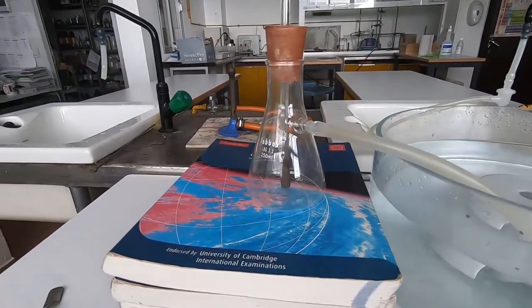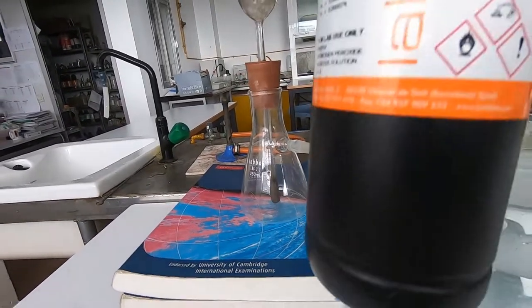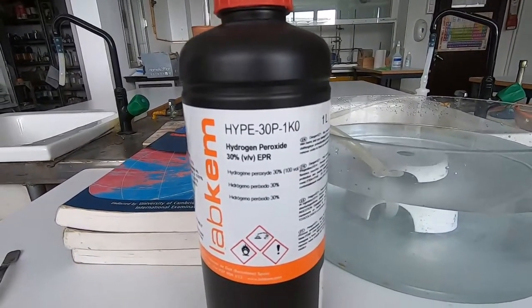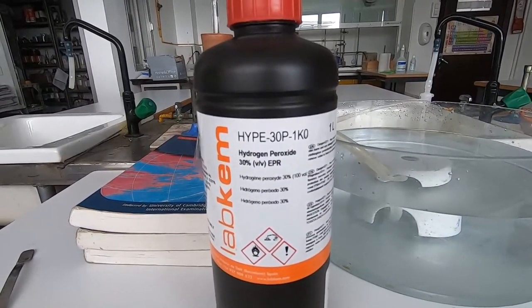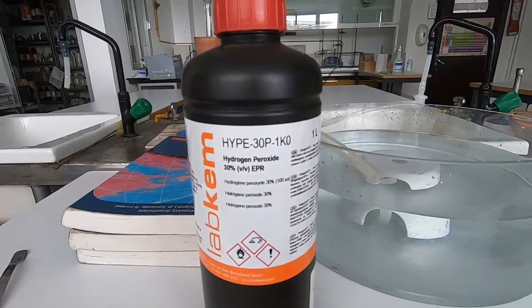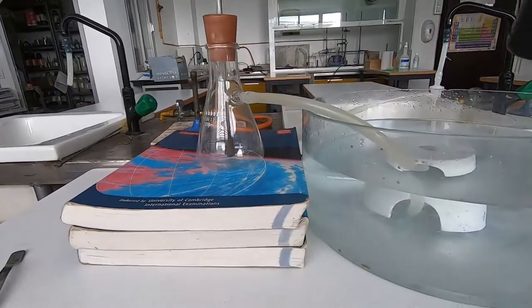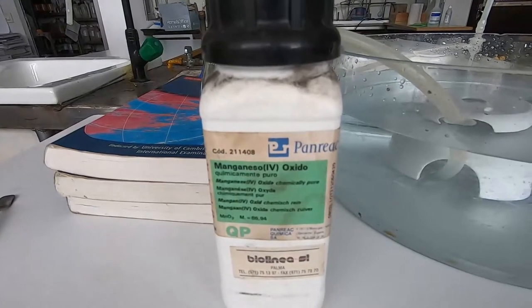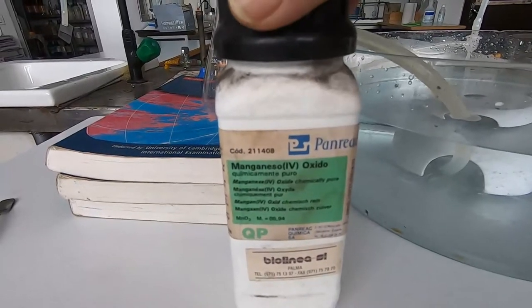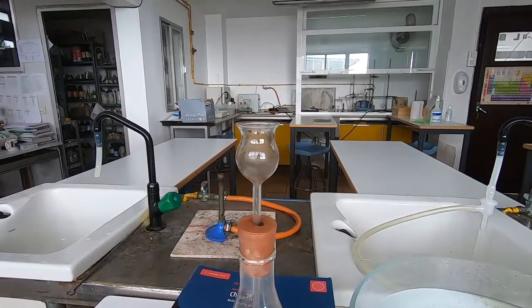The reaction that goes on inside the conical flask is the decomposition of hydrogen peroxide. This is 30 volume hydrogen peroxide — it's quite concentrated, so we're going to have to be a little bit careful. It decomposes naturally, but it's a very slow reaction, so we're going to speed that reaction up with the aid of a catalyst. The catalyst we're going to be using is manganese(IV) oxide. We're going to put that in the bottom of the conical flask, and then we will add the hydrogen peroxide through the thistle funnel at the top, very carefully.